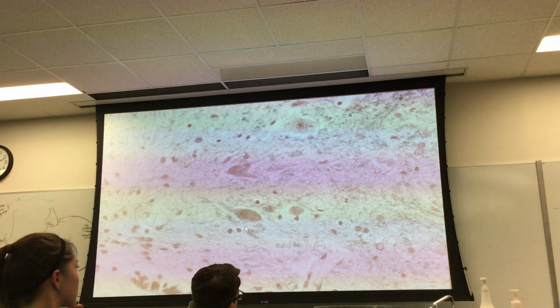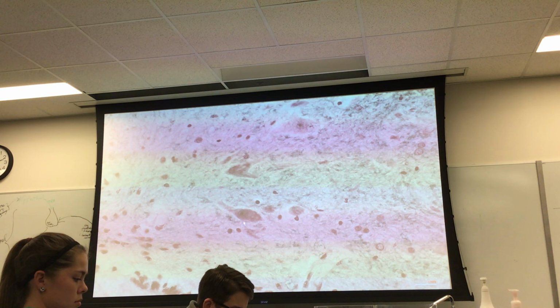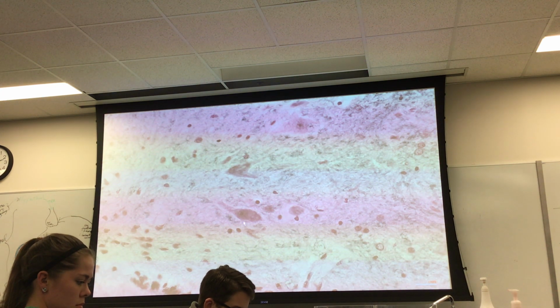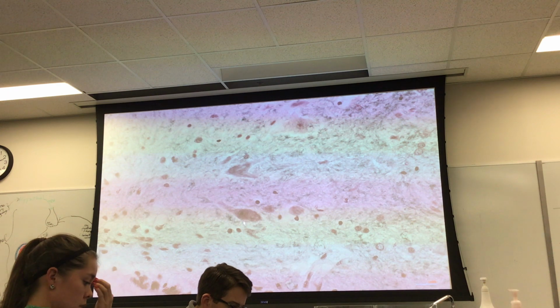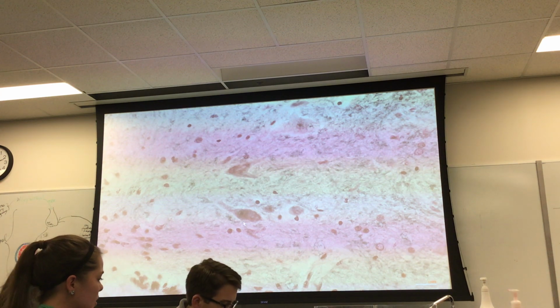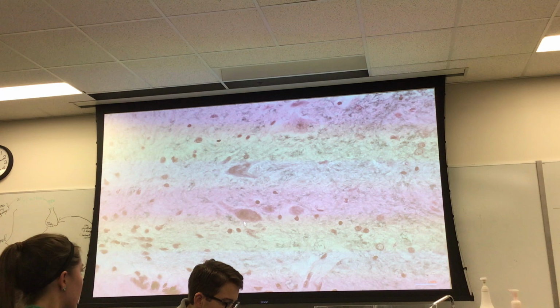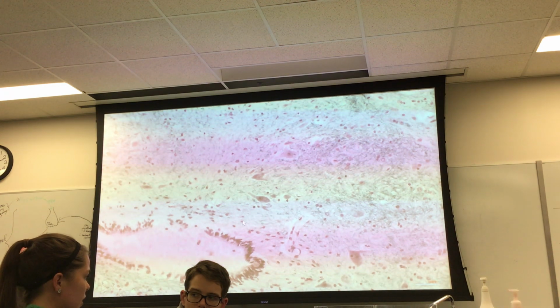This thing's got an eccentric nucleus. What is the one example of an eccentric nucleus in the central nervous system? I guess we can cover that quickly. It's called the dorsal nucleus of Clark. That is a dorsal nucleus of Clark neuron. Well, I just saved it to the review to show it to you.